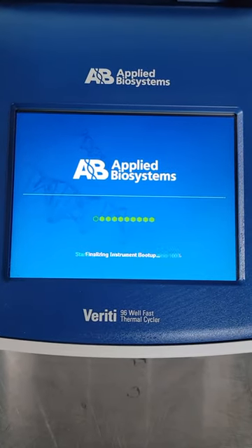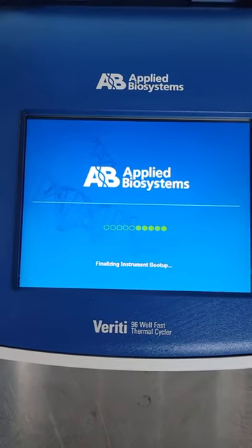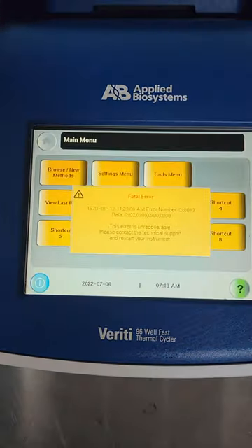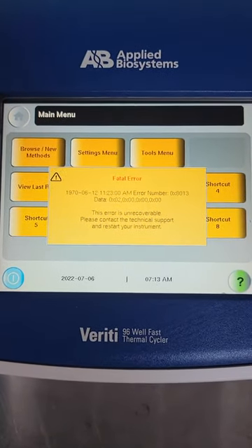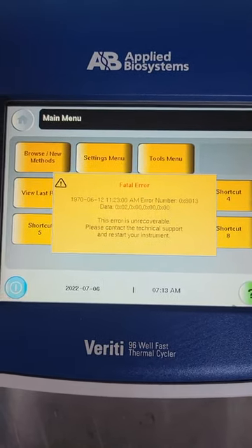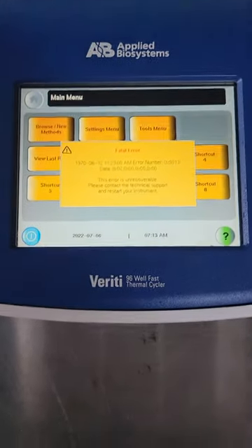When it's about to finalize, it goes into a fatal error. There you go — fatal error. It stays on this screen and says error number 0x8013. This error is unrecoverable; please contact technical support and restart your instrument.